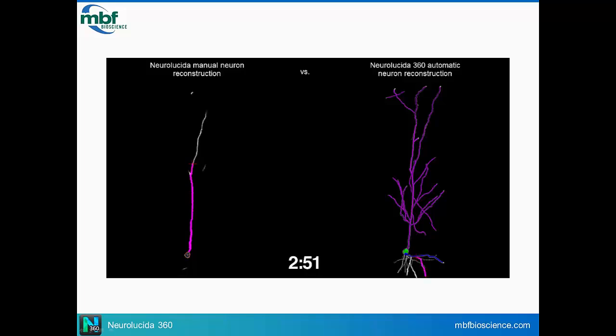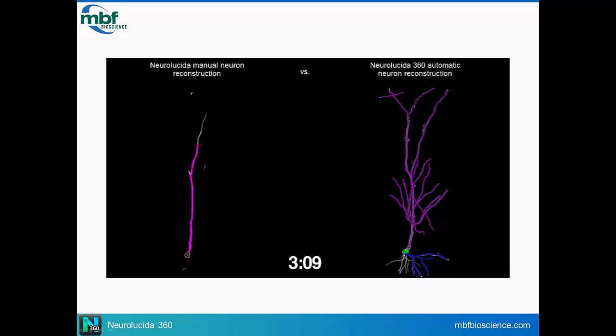But if you're using thick tissue sections, I don't think it's as bad as if you're going to be using a 50 micron thick section like you would for traditional immunohistochemistry. So, be careful, but you can always stick it in there if need be.